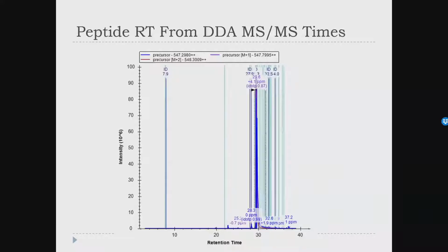And then when I actually looked at the data, again, you're going to get the chance to look at your data like this in Skyline. Here are the IDs. Here's an ID over here, and then you can see that there's peak tailing, and all these light blue lines are where the IDs are in all the other runs. So you can see that it goes pretty far out here from the apex of the peak. And then occasionally you get these weird things, like in this run they put too much of the IRTs in, and that caused problems.